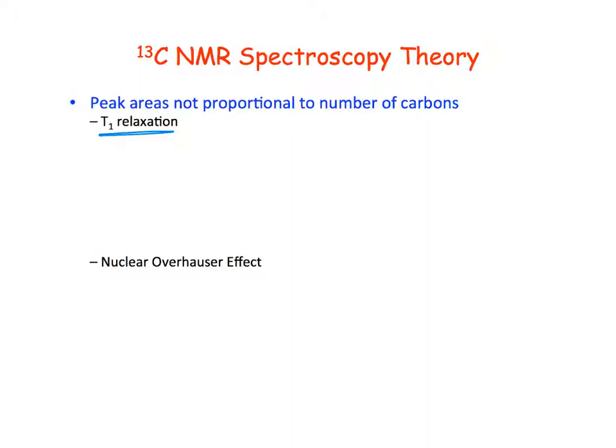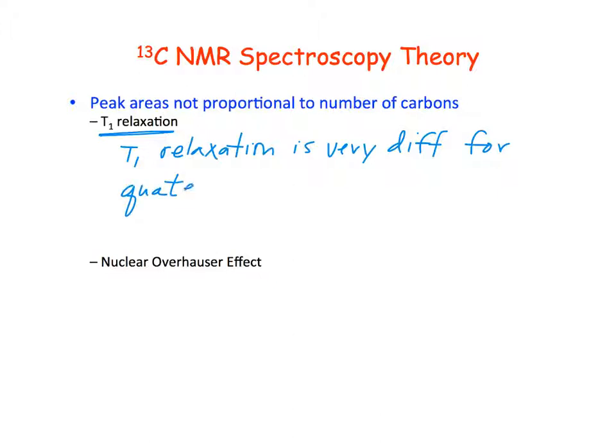So, the T1 relaxation is very different, let's say for quaternary carbons versus something like a methyl group.